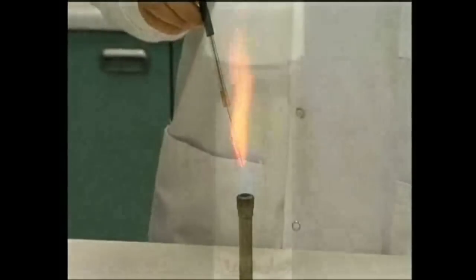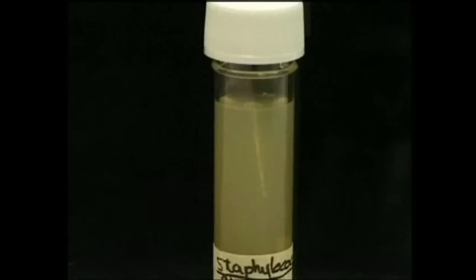Growth of anaerobic bacteria will be evident at the base of the agar wound, as there's little or no oxygen at this depth.